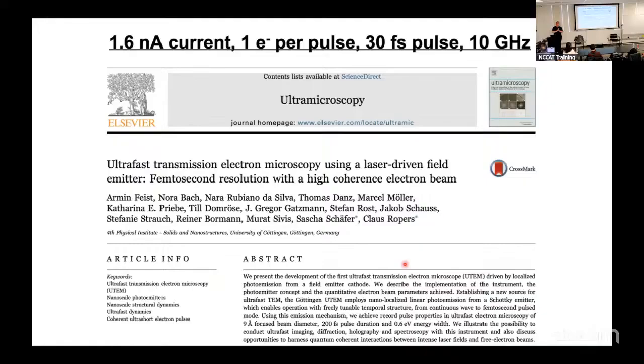The problem is that if you're using a continuous electron beam, that pulsed photon that's coming in is going to hit less than 4% of the electrons, because it's just going to miss them. They're just going to be coming through, the timing is going to be off, okay? And so 4%, you're not going to get any effect, right? So we did that calculation, and that was the number that it came out to be. So for us, if we want to see a meaningful effect, we have to synchronize it, basically.